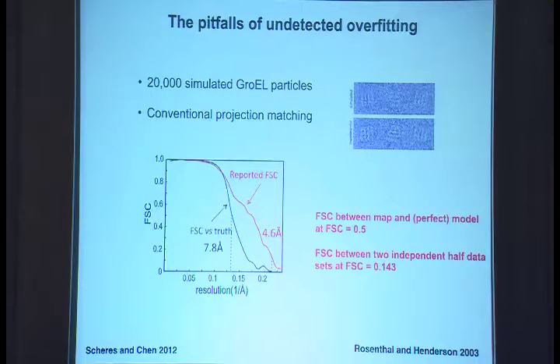No, it's not the best. It's a measure. That's it. In EM, the only way we have of estimating the resolution is based on FSCs, so you need to decide on one of these values. This was derived based on a comparison between X-ray and EM maps in 2003, and they calculated a figure of merit; I don't remember, but 0.5 was best.